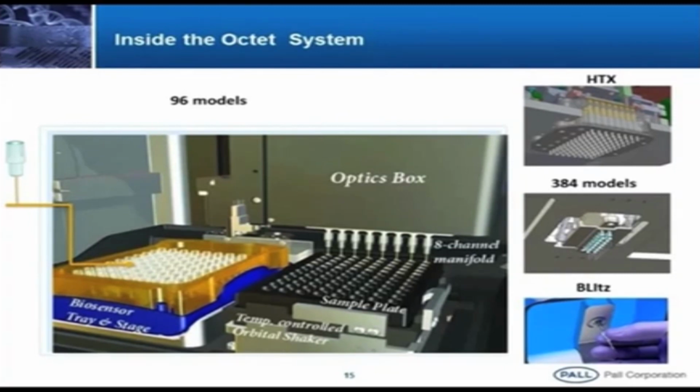So here, as I said, we don't have microfluidic devices. To assist binding, we require a shaker. The shaker enhances the binding. This shaker can work from 100 RPM to 1500 RPM, depending upon the application. Suppose I am working with a very high concentration, I can reduce to a low RPM, 400 or 500. If you are working with a very low concentration, then I have to increase the RPM speed. So the shaker will enhance the binding.